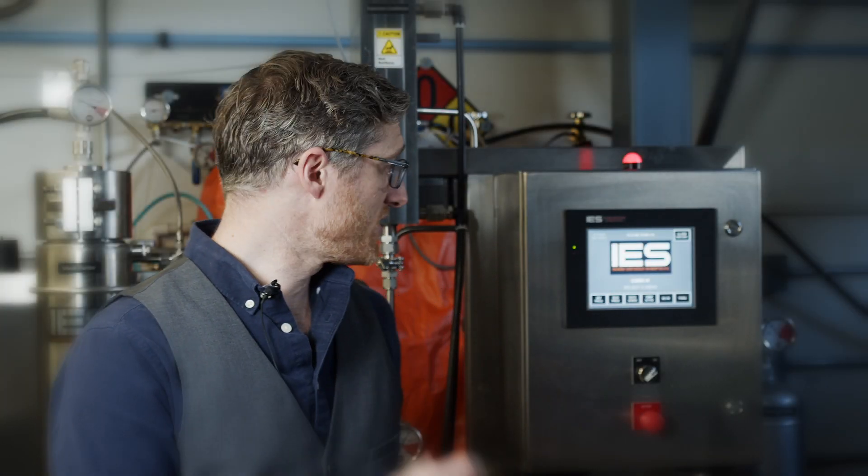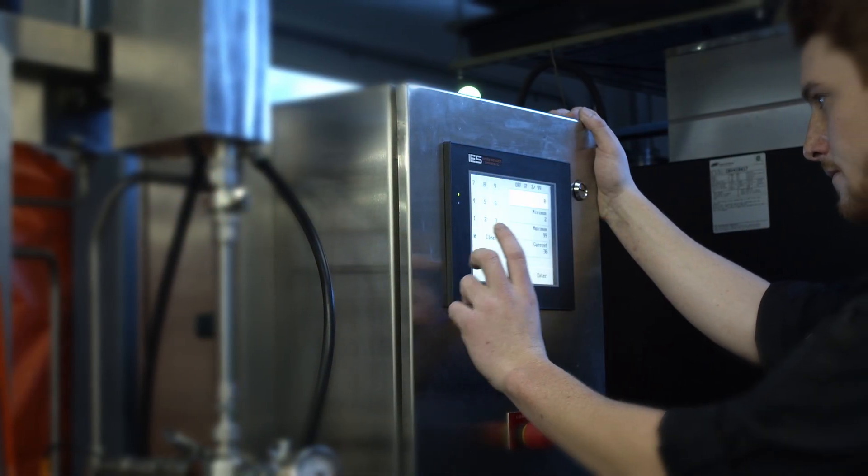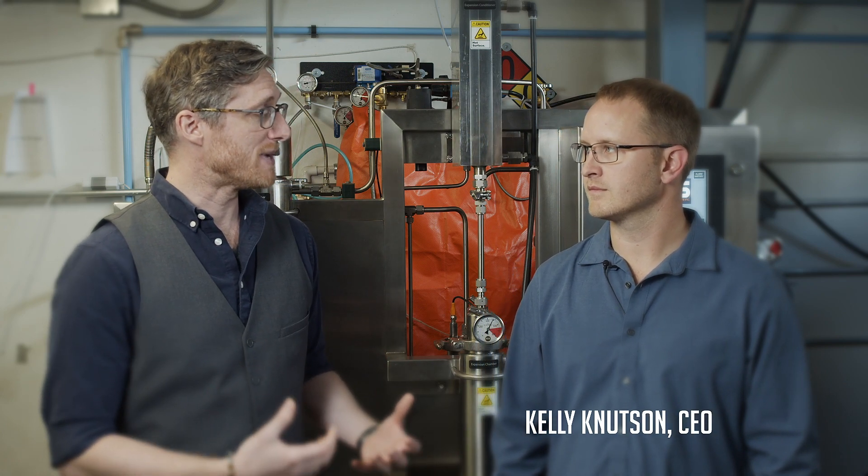Wonderleaf is so confident in our partnership with IES, because these machines that IES produce are so finely tuned that we're able to control our temperature and our pressure to very, very narrow degrees. We use this process because it's really important for us to maintain the cannabinoid ratios and the terpene ratios from plant to concentrate.